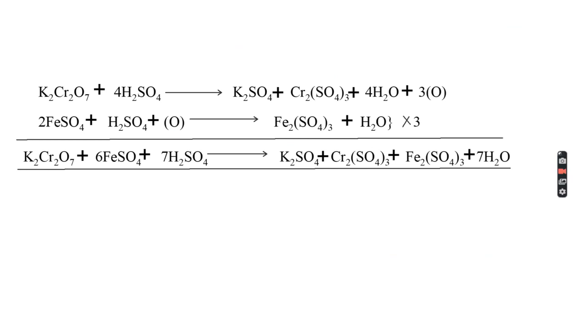And what kind of reaction takes place? Potassium dichromate in acidic medium forms potassium sulfate, chromic sulfate, water, and 3 moles of nascent oxygen. This nascent oxygen is utilized by the organic waste present in the sewage water. But still, some amount of nascent oxygen remains unreacted. What is utilized by the organic matter is consumed, and the unreacted remains as it is.